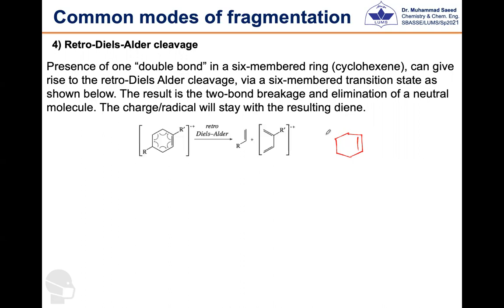Okay, so इसका mechanism कैसे ड्रा करना है कि you always start from the pi bond और single arrow के साथ आप next bond की तरफ move करते हैं दोनों साइड से, and the neighboring electron will move toward it to complete the 6-member transition state. तो आपने ओवरऑल इसमें 6 एरो ड्रा करने हैं और 6 एरो में आप देखेंगे किसी जगह पे उनके हेड आपस में मीट कर रहे हैं। जहाँ पे हेड मीट कर रहे हैं वहाँ पे एडिशनल बॉन्ड बनेगा, जहाँ पे टेल मीट कर रही है वहाँ बॉन्ड ब्रेक होगा और इवेंचुअली we will end up with a species like this.